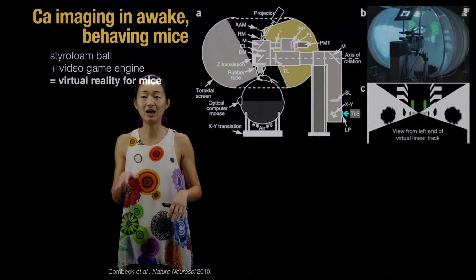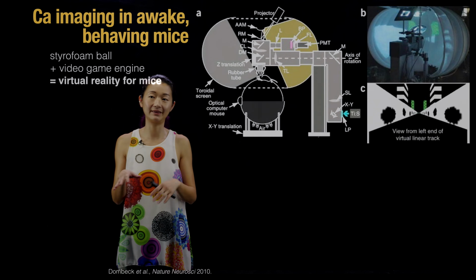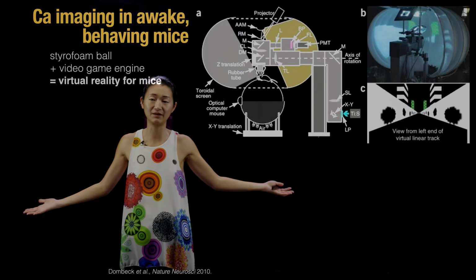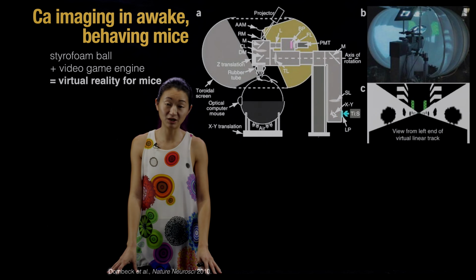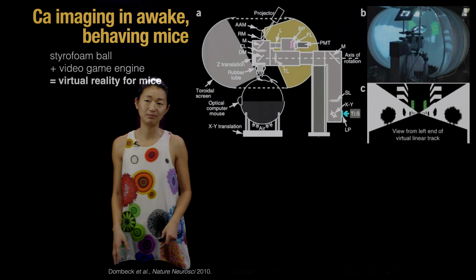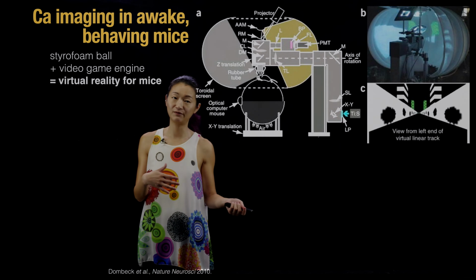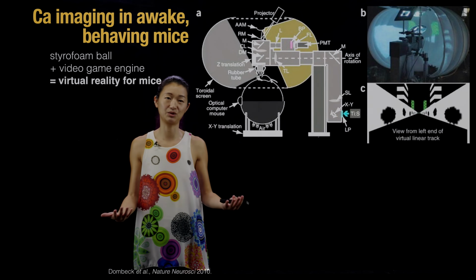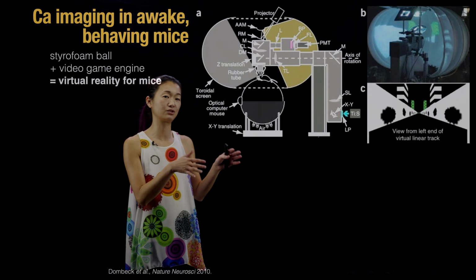So this is what's called an omnidirectional treadmill, of the kind that you may have seen. People have actually built versions of this for humans. It's just gigantic if you have to build one for a human. And it's also proposed as one of the more plausible ways of doing virtual reality for humans as well. You want an omnidirectional treadmill, because otherwise you can only run in one direction. It's not particularly interesting. So these mice are running on an omnidirectional treadmill.